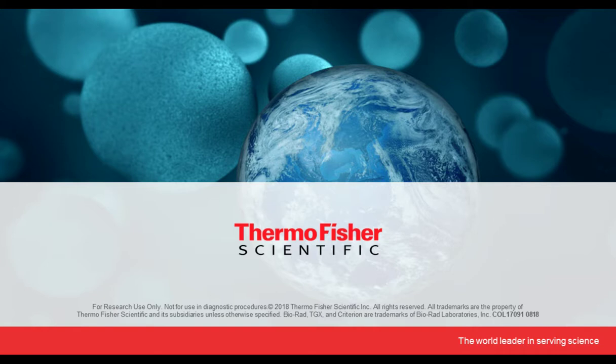So let's get started. Our first question is, can customers use their own electrophoresis buffer with Tris-Glycine precast gel from Thermo Fisher Scientific?